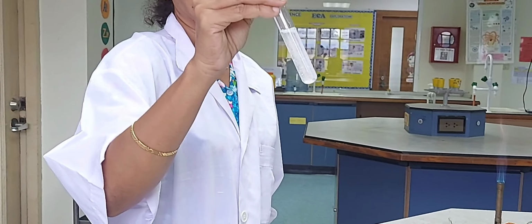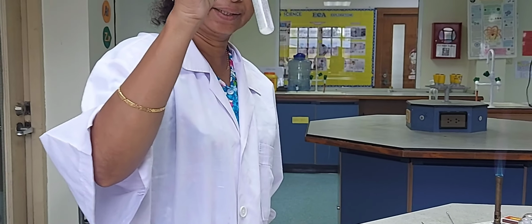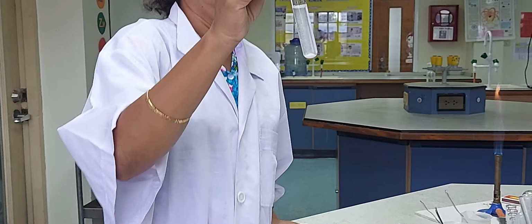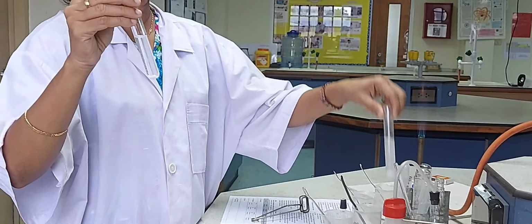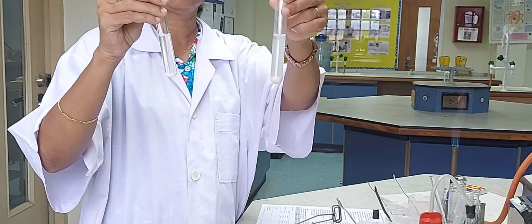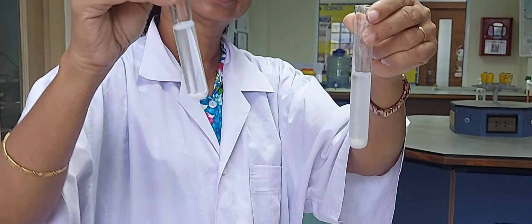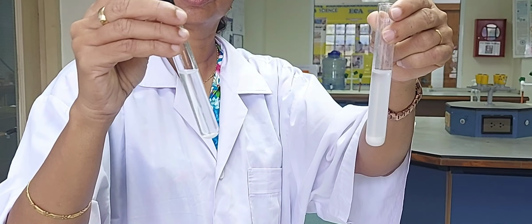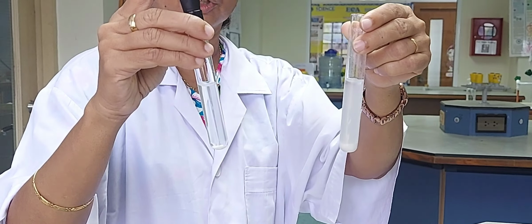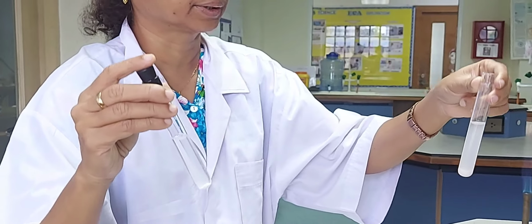So you can see that it is not completely soluble, it is partially soluble, and there is some residue at the bottom. Whereas in the case of calcium hydroxide, this is the solution obtained. So barium hydroxide is partially soluble and calcium hydroxide is also partially soluble. But if you compare the solubility, barium hydroxide is more soluble than calcium hydroxide.